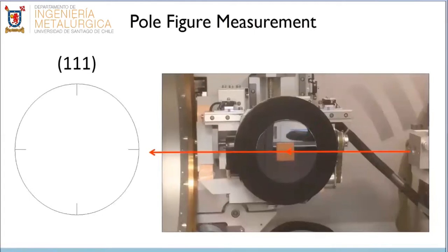should be detected. Once the measurement begins, the first thing that will happen is that the sample will rotate 360 degrees in phi, which will be represented as the appearance of data in a similar fashion on the left. The sample will then rotate back into the screen in chi, which will be represented as a movement away from the origin in the pole figure.